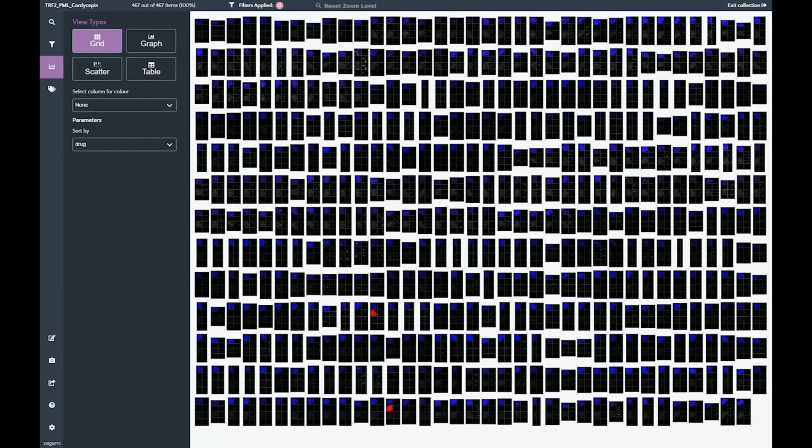Hi, today I'm going to talk to you about how Zegami can be used in high throughput screening. This was a paper published in Nature Communications in 2015 where we were studying how a molecule called ATRX was being suppressed. ATRX is an important molecule in a type of cancer that is associated with the lengthening of telomeres.